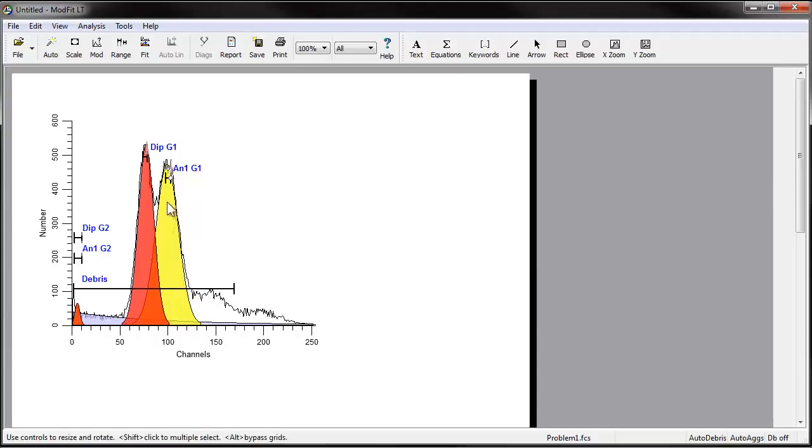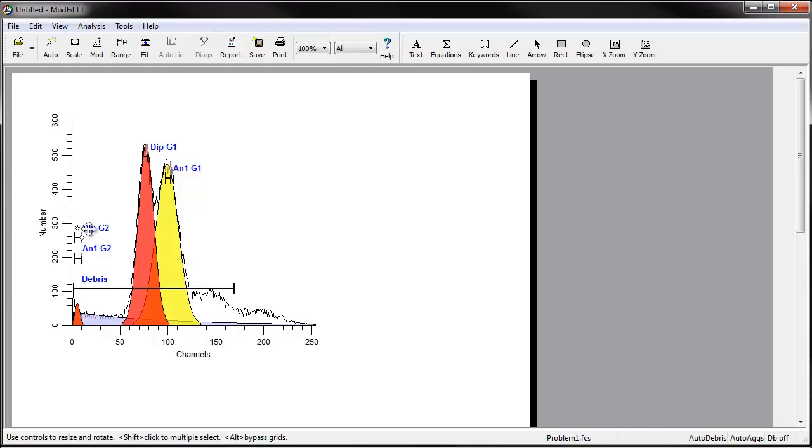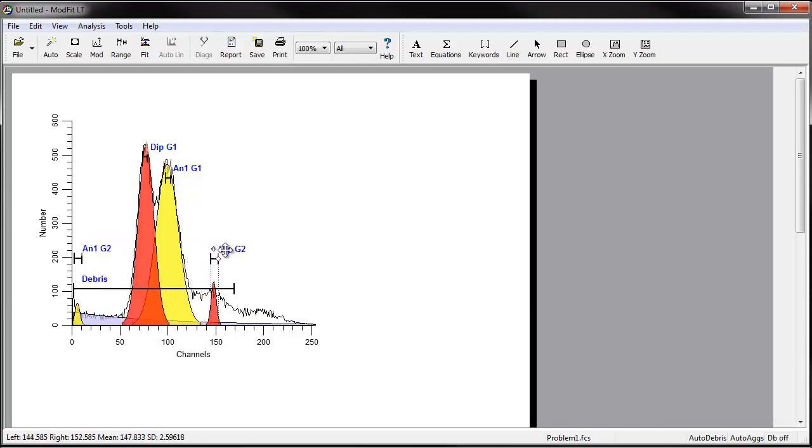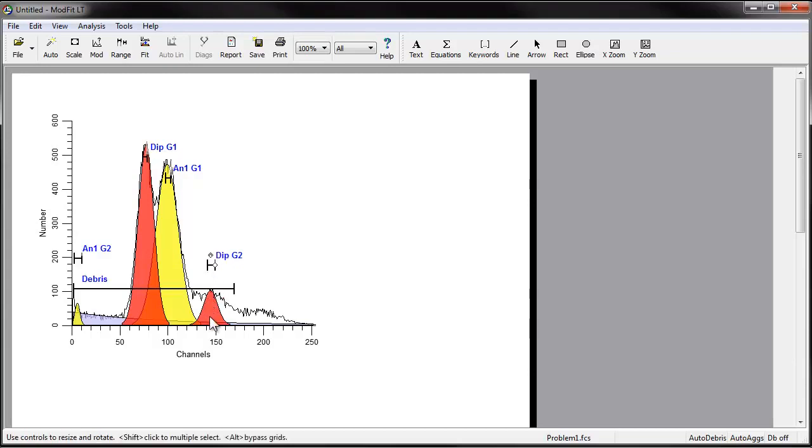Move the DIP-G2 range over the portion of the histogram that is about twice the position of the DIP-G1 range. This is the approximate position of the diploid G2-M.